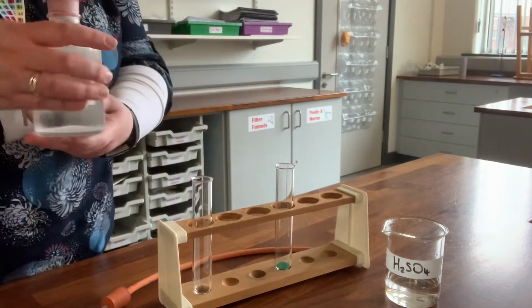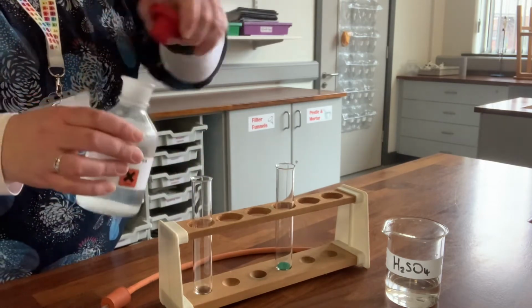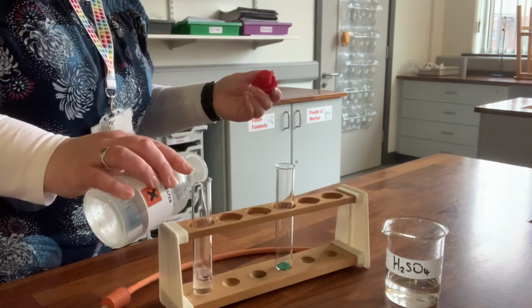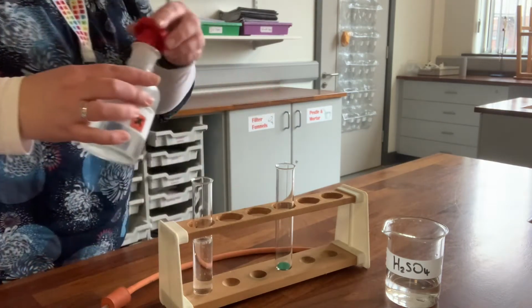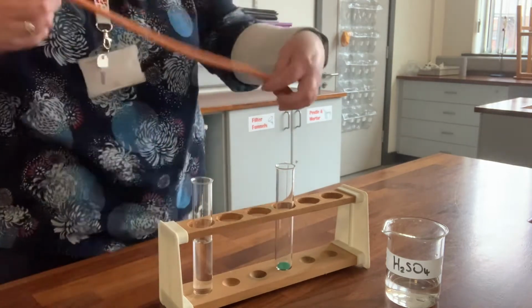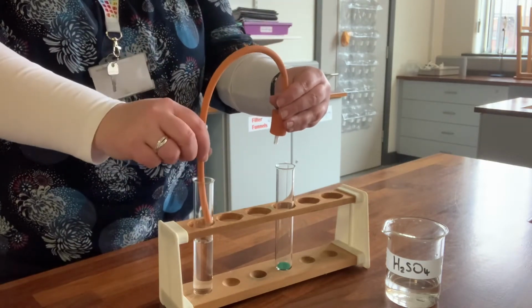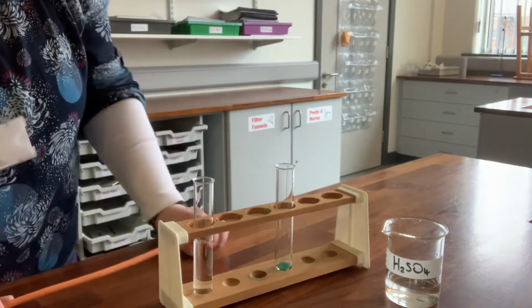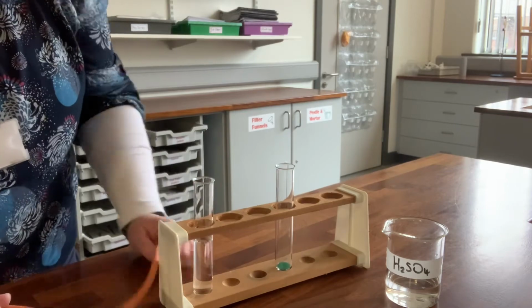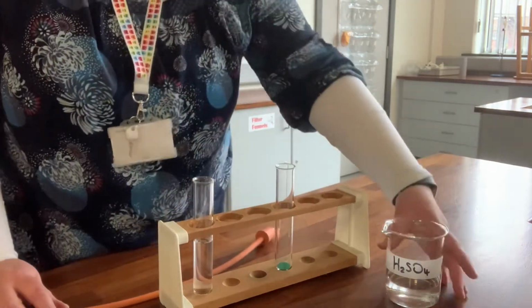And how we do that is that we bubble it into lime water. So I'm going to add some lime water to this test tube that we can then pass the bubbles produced in the reaction into. And to do that, I'm going to use the stopper here and then the rubber tube or the delivery tube, passing it into the lime water. It proves that it's carbon dioxide produced when the lime water turns cloudy. So that's what we're looking for. Our observations for this reaction we'll go through as I go.